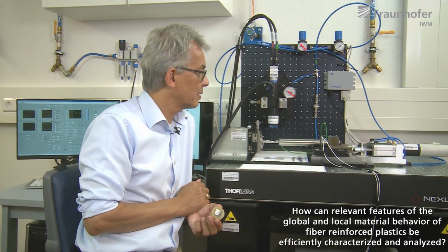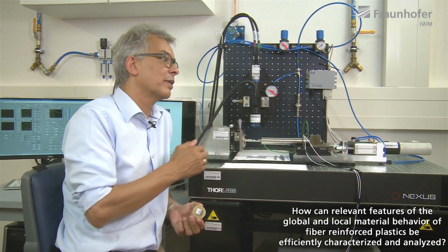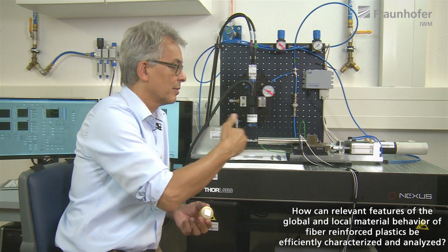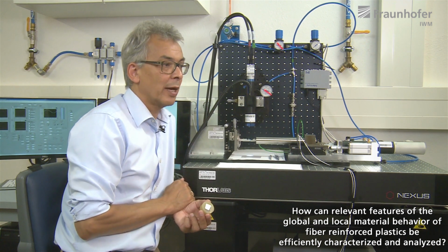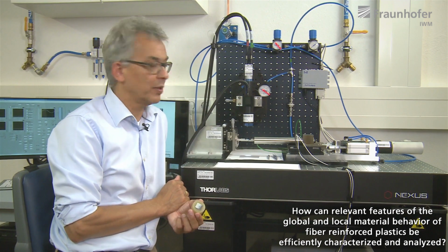You see here this test setup. This time it's not loading in one direction, slowly or fast, but it's doing a cyclic loading, which we use to be able to make assessments of lifetime or fatigue behavior.